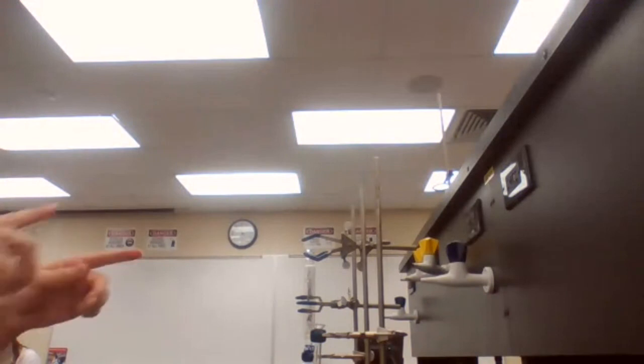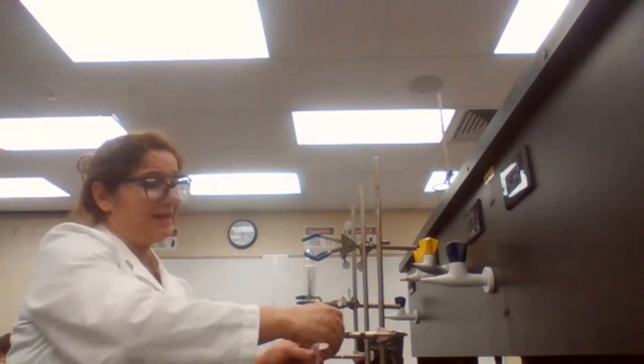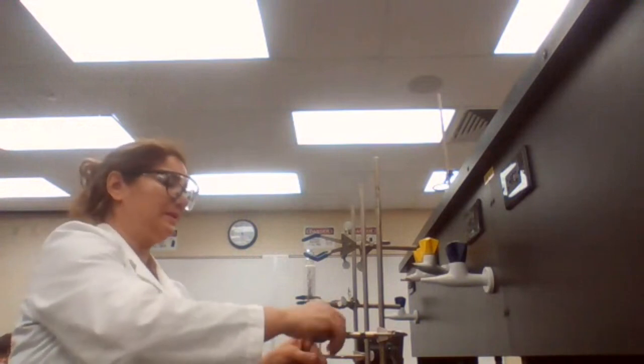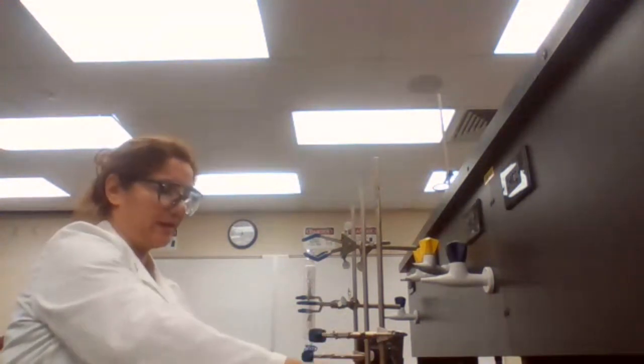The chemicals must be properly disposed of. If we have a container in the fume hood that is labeled for distillation, we place it in that. If not, it would be non-halogenated organic waste.